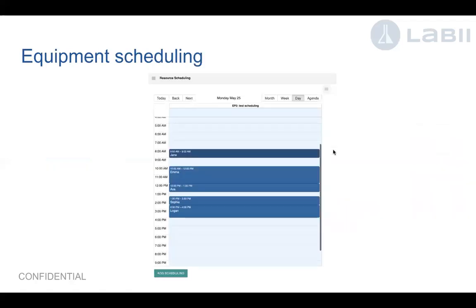The third one is that we have some widget scheduling functions. For example, if you have equipment, you can attach this widget to your equipment directly. Then you can say for this much time this person is using it, and at other times other people are using it. This function can also be used, particularly during the pandemic, to schedule different offices and different labs. Say at this time, you only allow 2 people inside the lab.